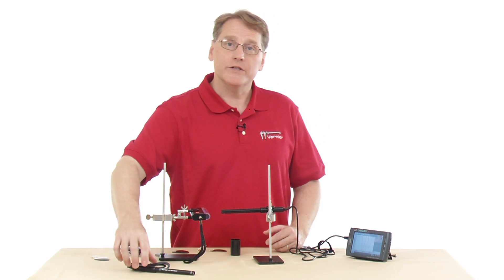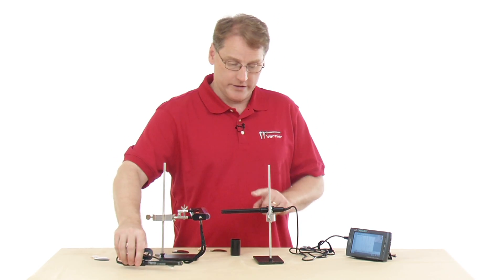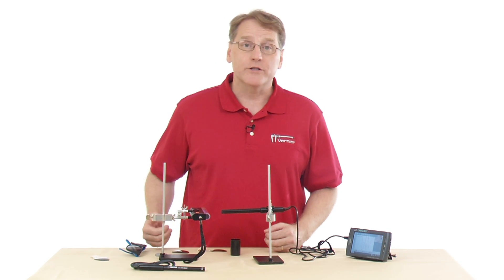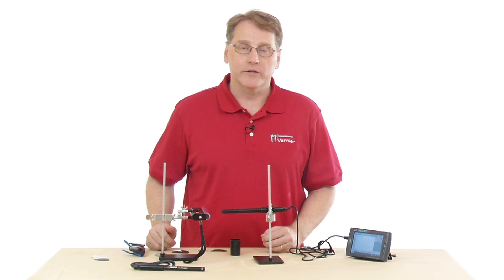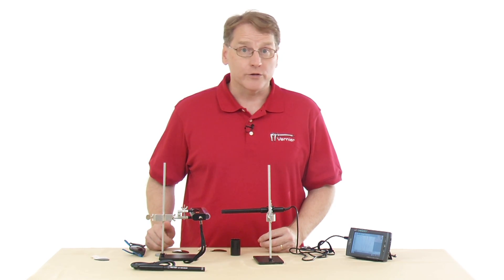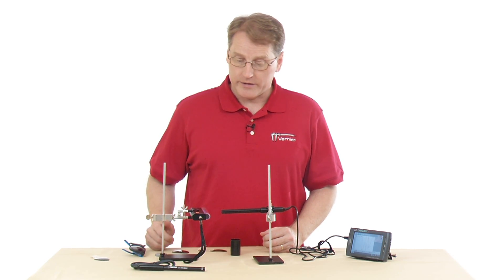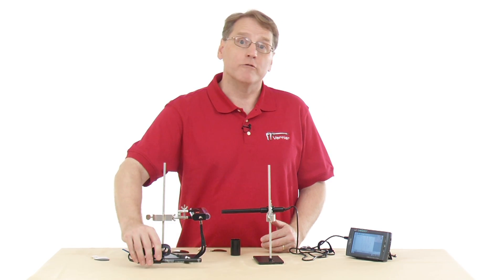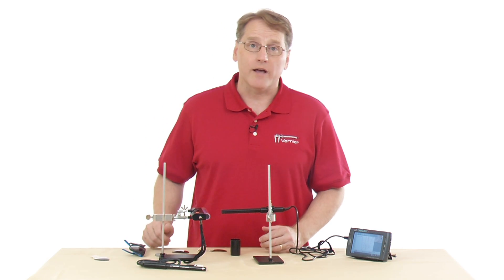So again, there are two UV sensors — the UVB and the UVA. Depending on what UV radiation range you expect from your source, you would use one or the other. They're used in environmental and earth science work, and there are some really interesting labs that can be very relevant to students' everyday lives.